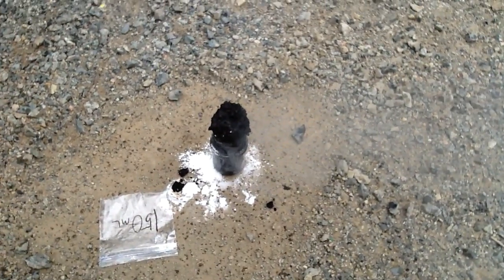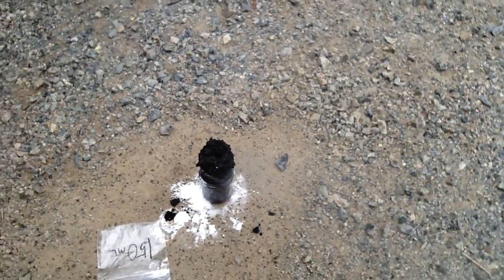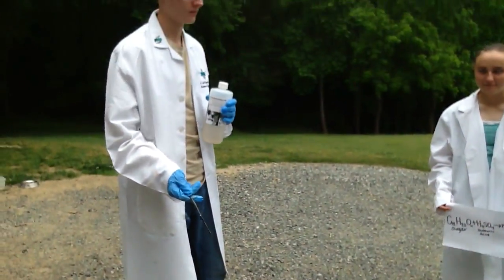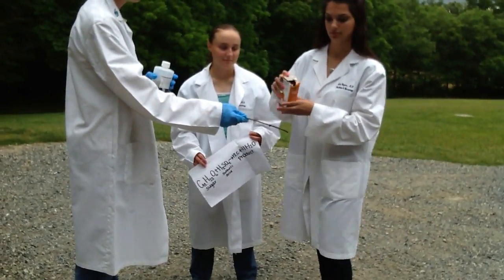The 150 milliliters of powdered sugar and the sulfuric acid have mixed together to produce the product, which is H2O and carbon. And you pour a little bit of the strong base to neutralize this.